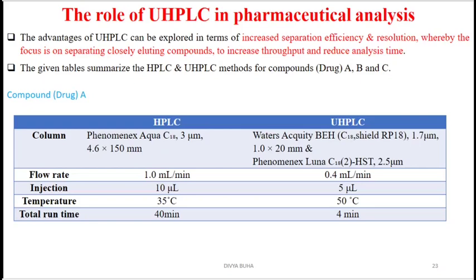Hi everyone, I am Dr. Devya Boha, and in this video lecture I will be discussing the role of UHPLC in pharmaceutical analysis.